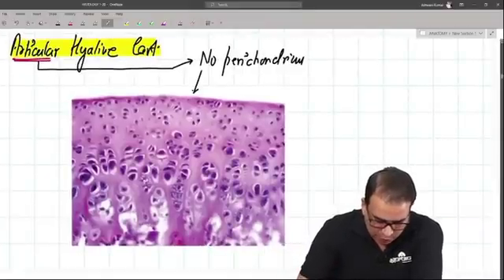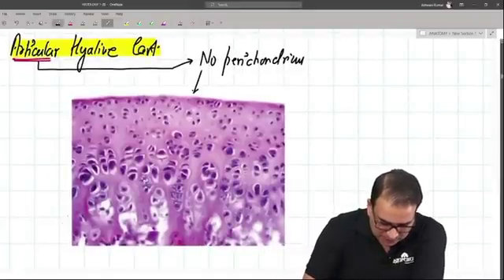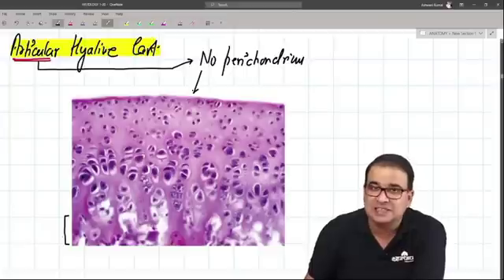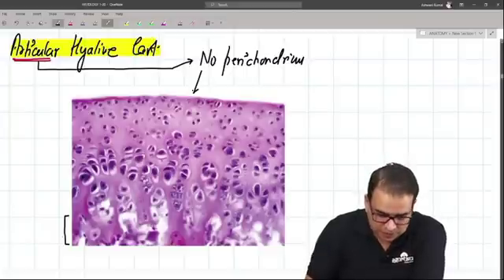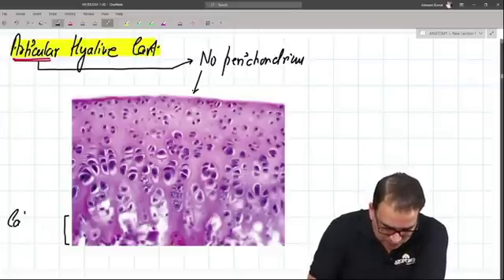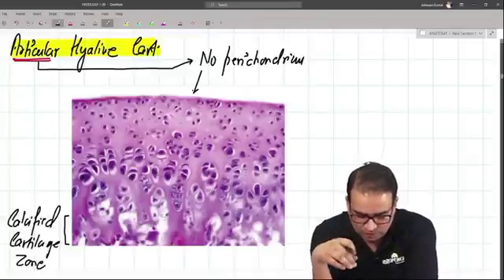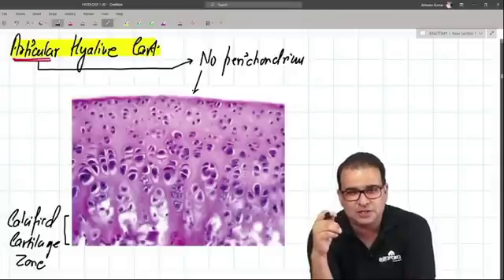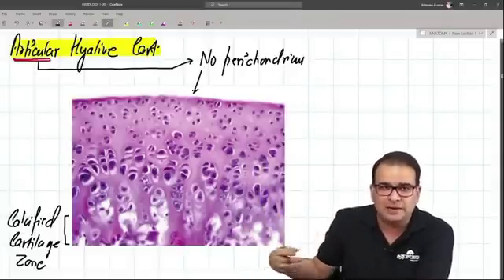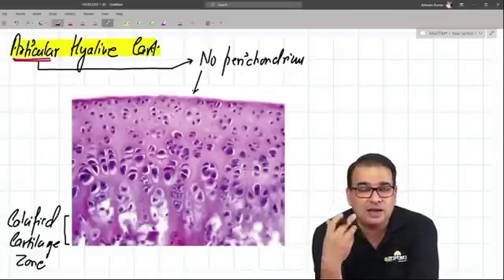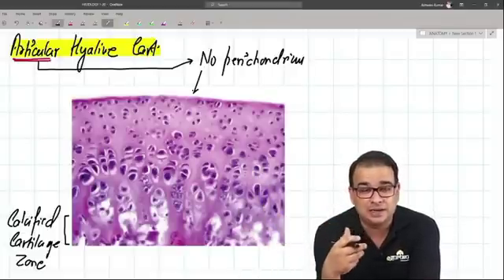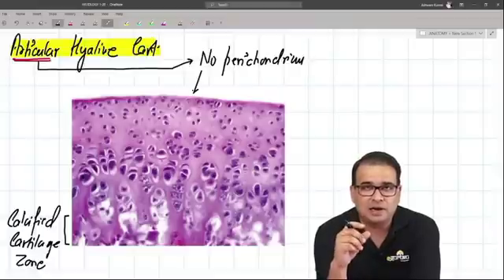The second important thing to note is the basal part. This here is actually the calcified zone — that's a calcified cartilage zone. You can see a lot of blood vessels also in that region. The bone will start actually after that. So it's a calcified cartilage zone, again representing that this is a slide of a hyaline cartilage.